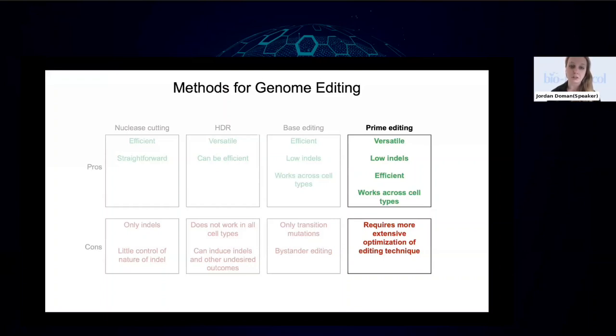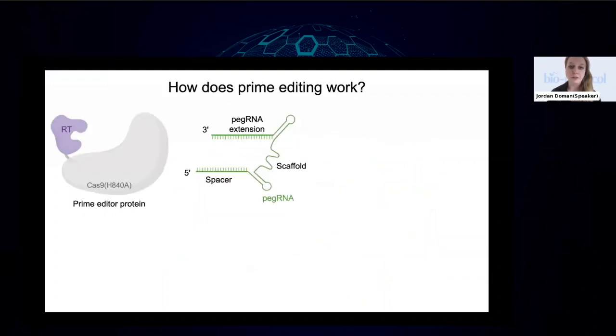So it's a really powerful technology. But the downside of prime editing is that it requires a bit more optimization and a bit more time spent on your editing technique than some of these other technologies that I just talked about. But that's kind of what we're here to address today. So how does prime editing work?